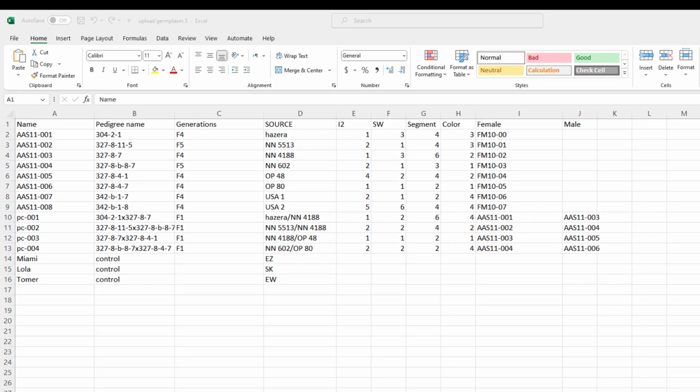In this example, we will focus on uploading a germplasm set. The germplasm set represents genetic material of any type, breeding lines, parental lines, hybrids, introductions, accessions, and so on. The upload mechanism will allow me to import a list of germplasm, their linkage to previous generations, and any attribute they may have, such as pedigree name, generation, marker data, etc.